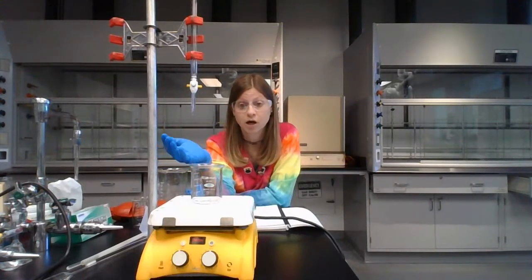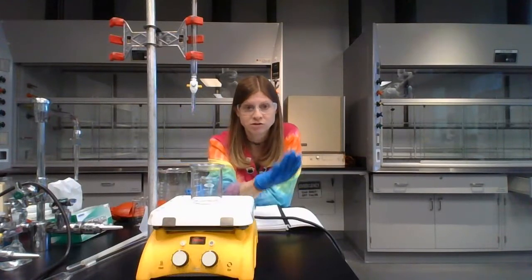Okay. I would also make sure that you don't have any valuables with you. Make sure your cell phone is in your bag somewhere else. You don't want that on you. We've had people that put their cell phones on the lab bench.